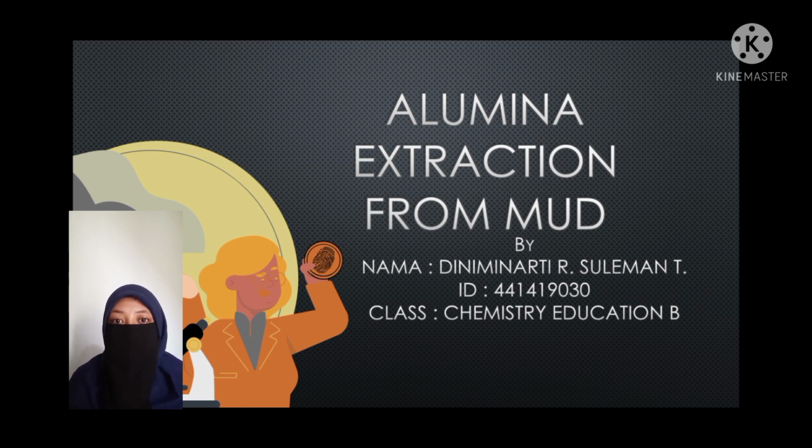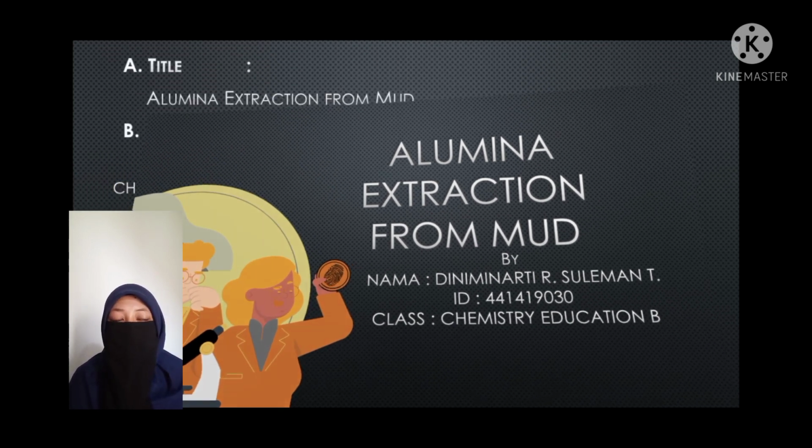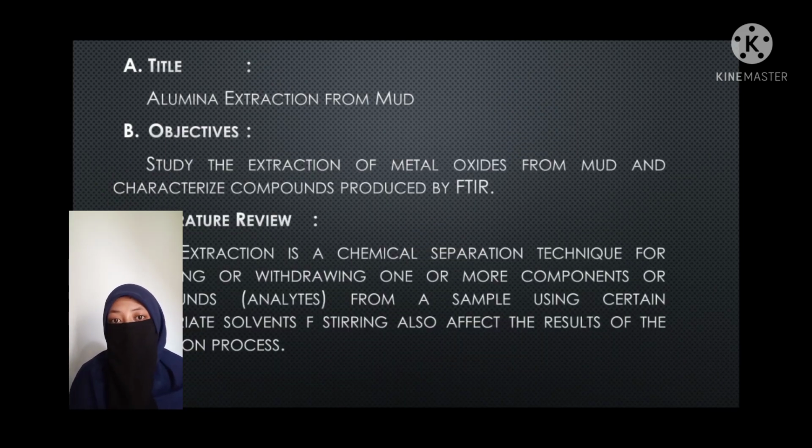Okay. Here I will present about alumina extraction from red mud. Title: Alumina extraction from mud. The objective is to study the extraction of metal oxides from mud and the characteristics of the compounds produced by FTIR.